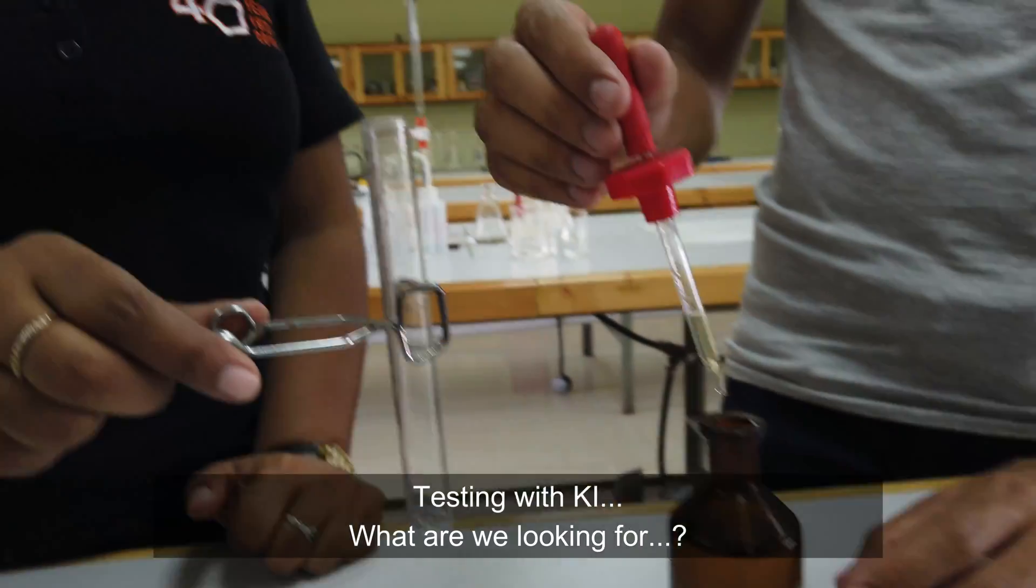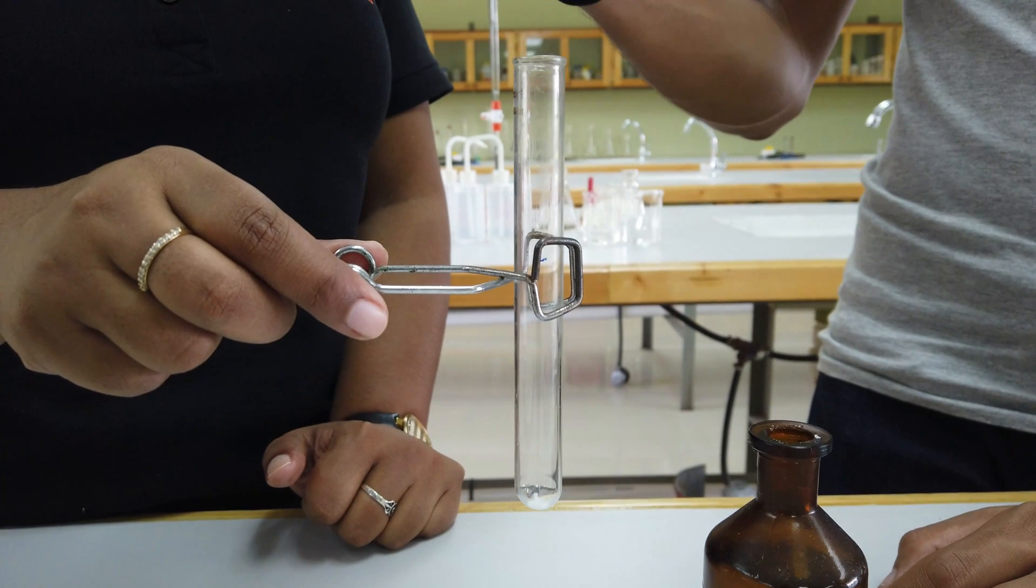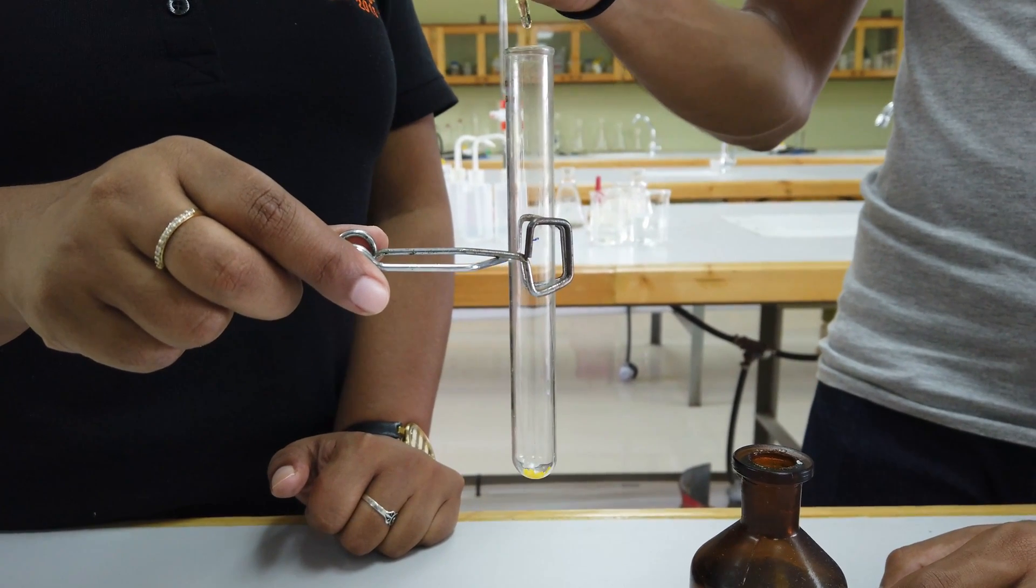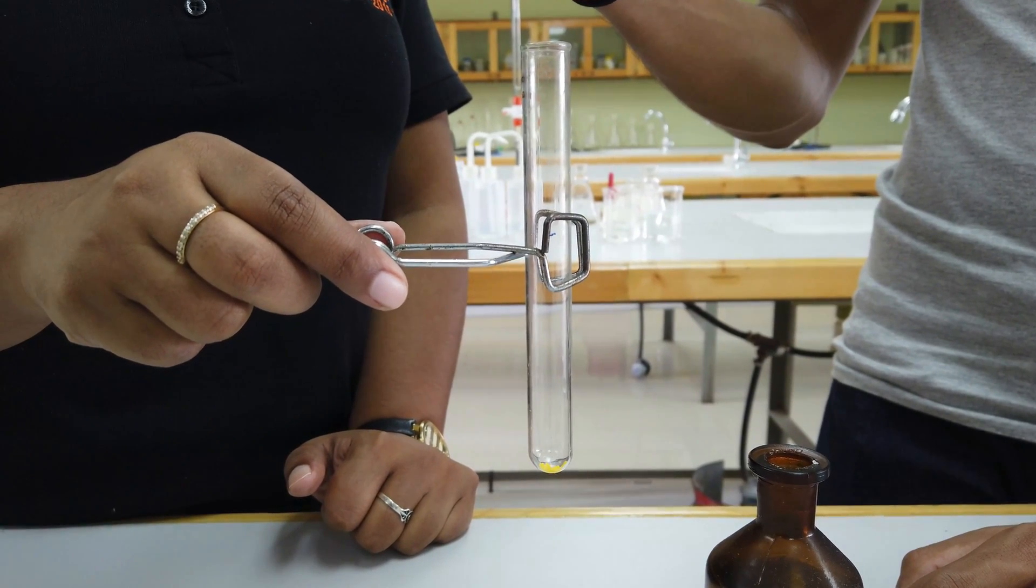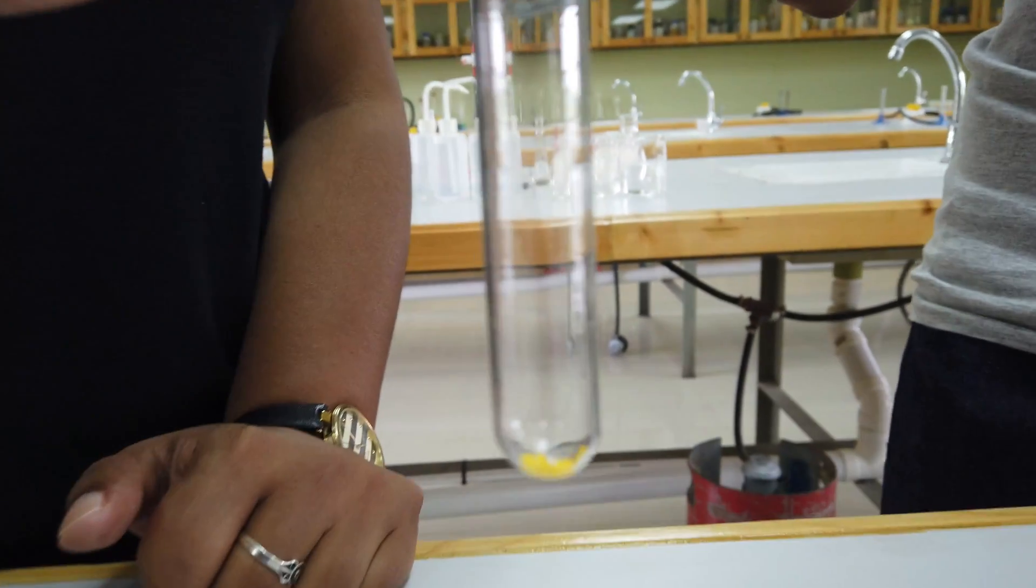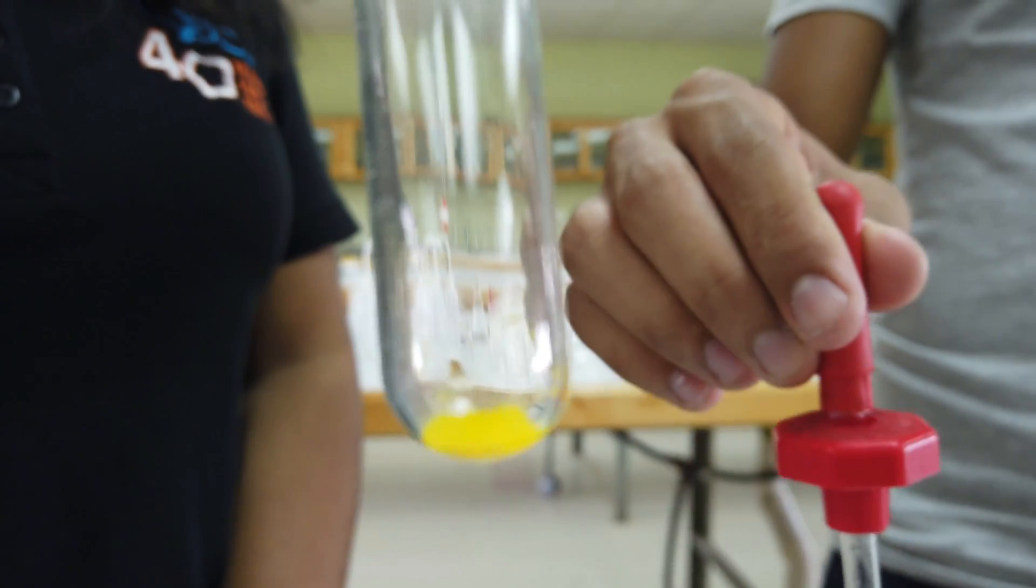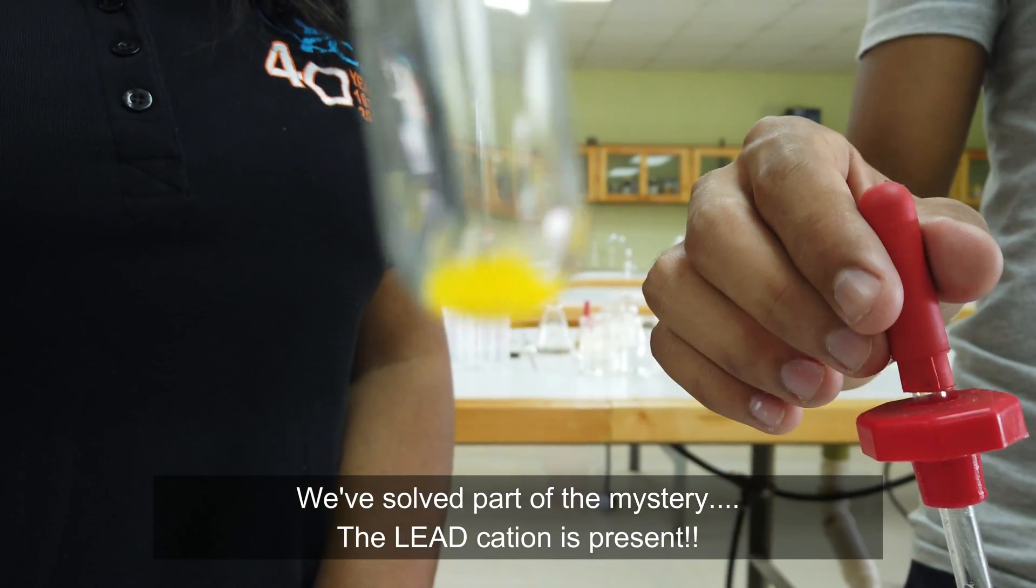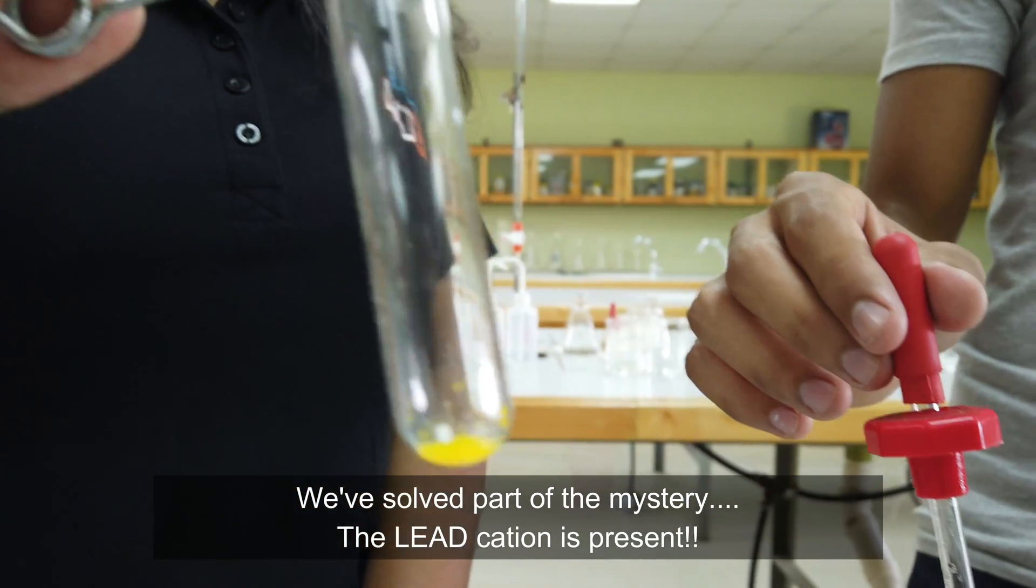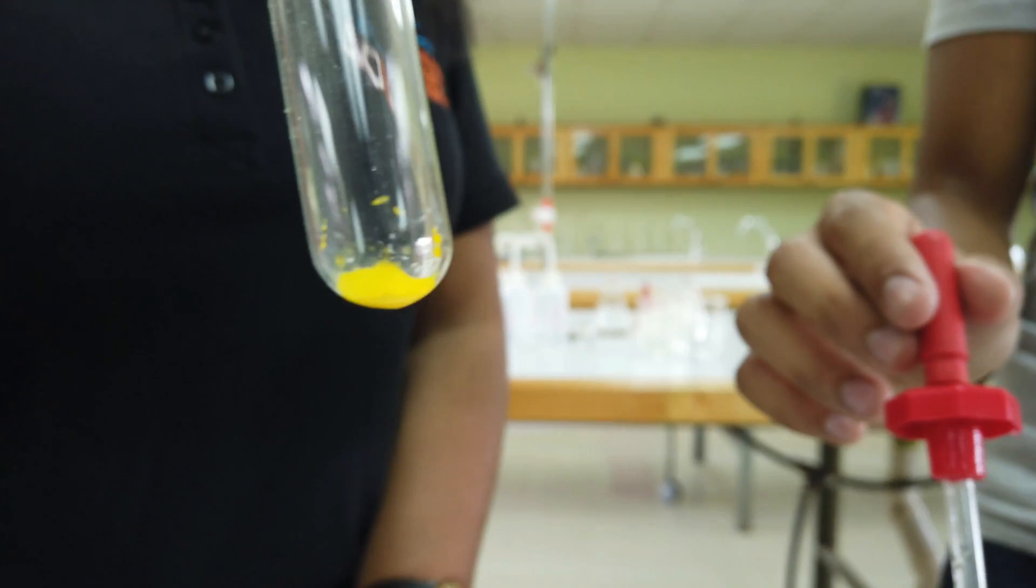This time we're going to use some potassium iodide. Again, we're looking for a change of color and a change in solubility. Did you get a change in color? That bright yellow precipitate that you see - we can't argue with that. As soon as you see that bright yellow precipitate with KI, we know that the cation is lead.